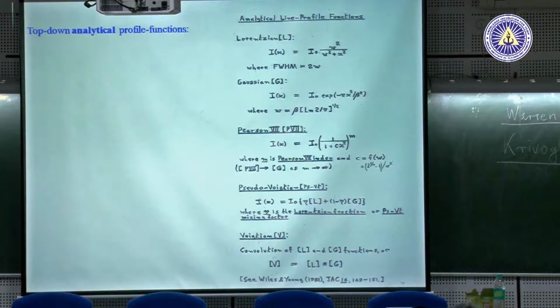Actually, originally it was the Voigtian function, but before laptops or PCs, integration was too difficult, so people invented the pseudo-Voigt instead of the Voigt, in which the Gaussian and the Lorentzian are not convoluted, but just added up with a fraction. That is the difference between Voigtian and pseudo-Voigtian. Pseudo-Voigtian works perfectly for Rietveld.